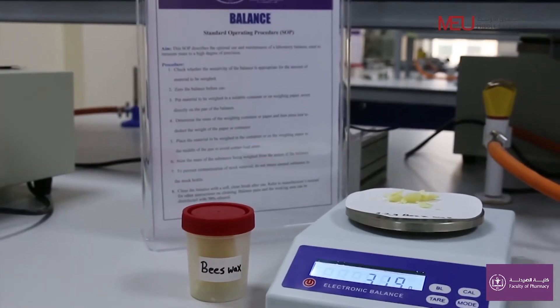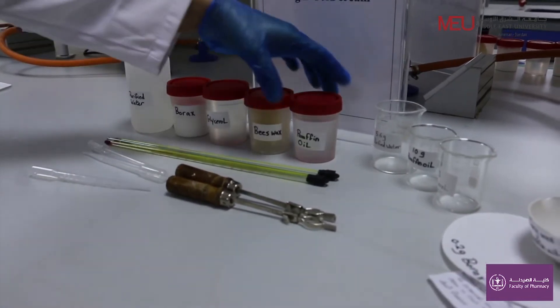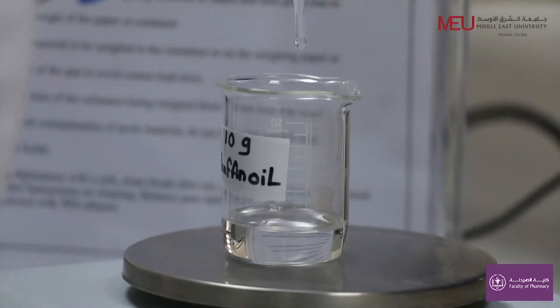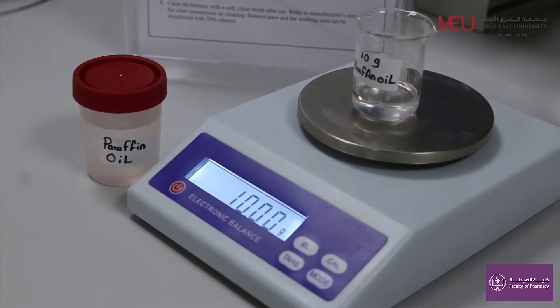Here, beeswax is used as a stiffening agent. Weigh 10 grams of paraffin oil. Here, paraffin oil is used as an emollient.